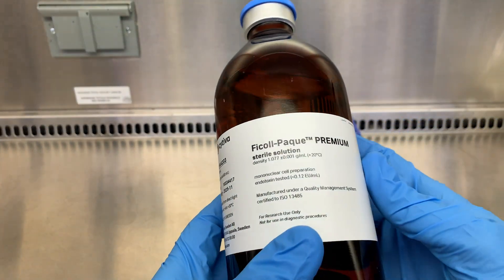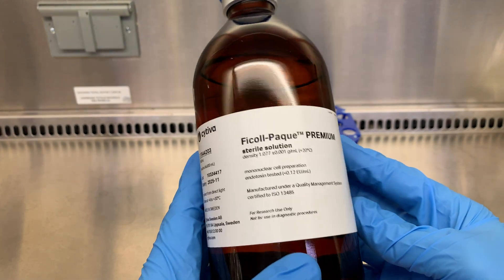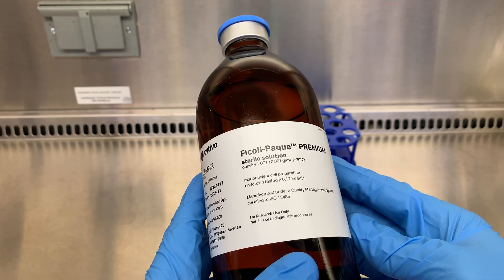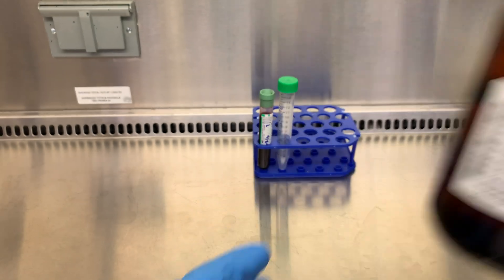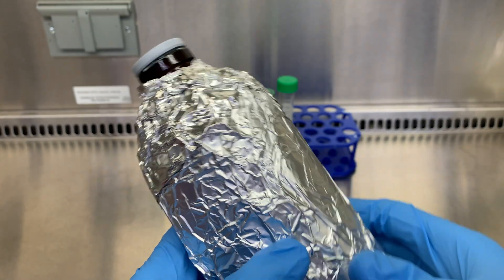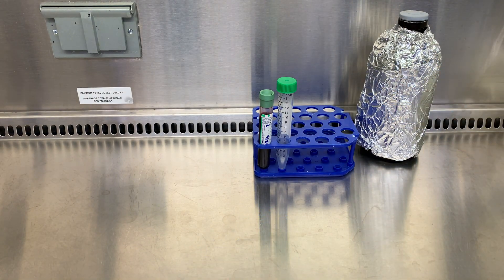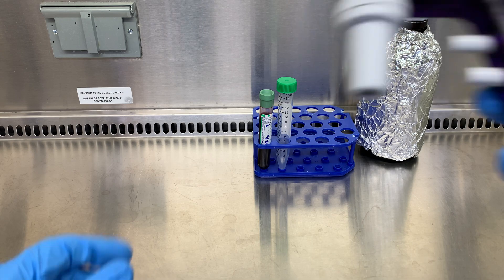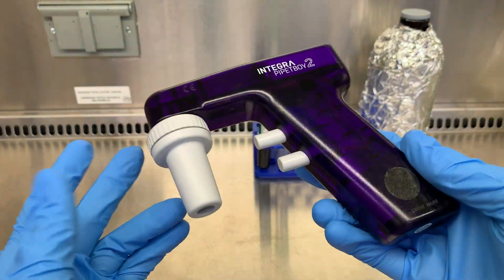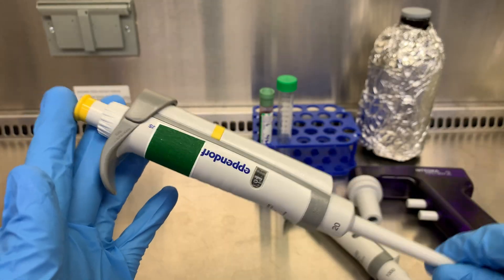Next we have our Ficoll pack, which is just a solution with a density gradient designed to separate the lymphocytes from red blood cells. There are other similar products from other brands, such as Lymphoprep. I don't think it makes much of a difference. I'll have my Ficoll wrapped in foil just to minimize light exposure. You might also want to keep this refrigerated for storage, but make sure it's at room temp for this protocol. We have our centrifuge, and for my procedure I'm going to use a pipette aid — a pipette gun, whatever you want to call it — a 1000 microliter pipette, and a 20 microliter pipette.